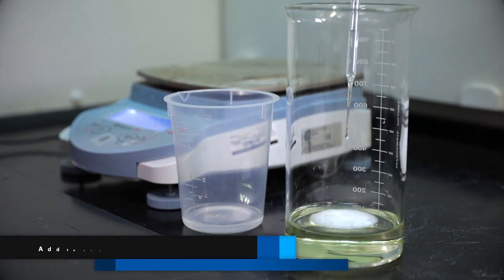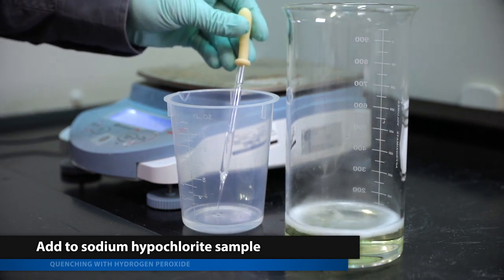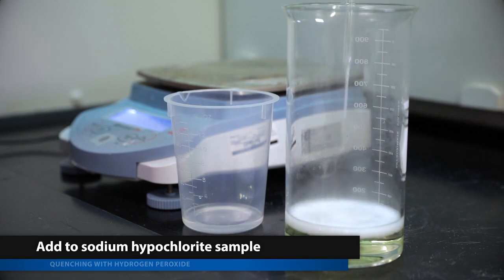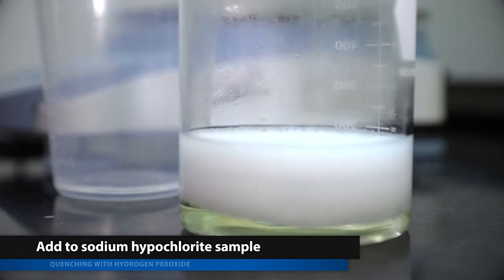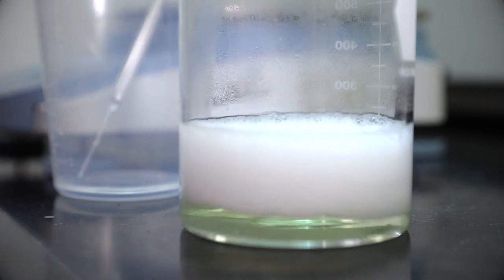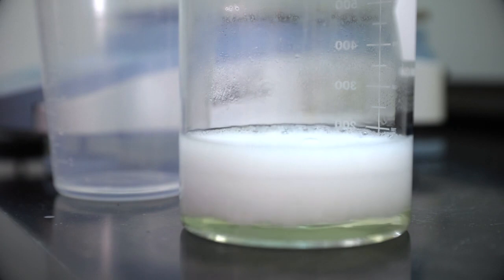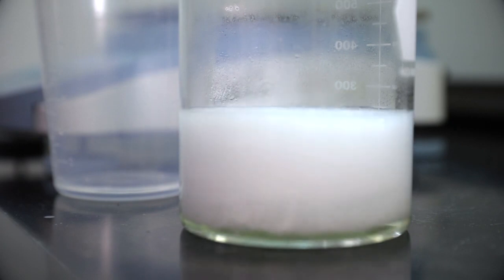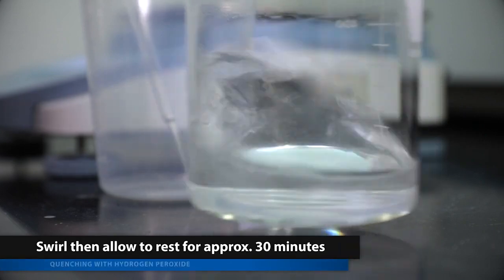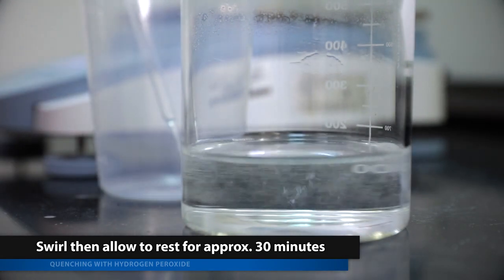Using the pipette, carefully begin adding the measured dose of hydrogen peroxide dropwise to the sodium hypochlorite sample. The sample will bubble and foam. Allow bubbling to subside after each addition before adding more. Continue to slowly add all of the pre-measured hydrogen peroxide. Carefully swirl the mixing beaker and allow the quenched sample to rest uncovered for about 30 minutes, or until the temperature of the sample has stabilized.